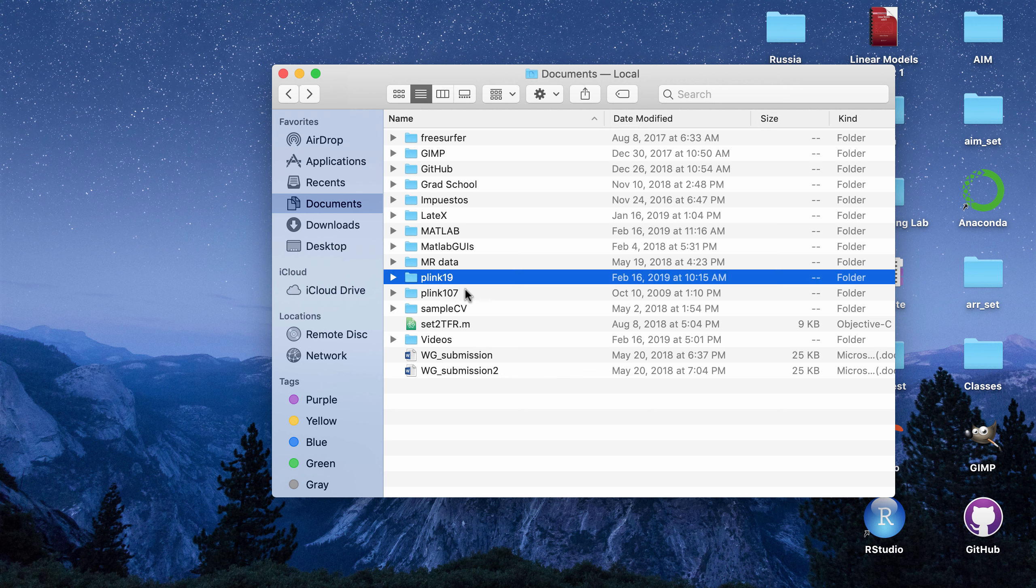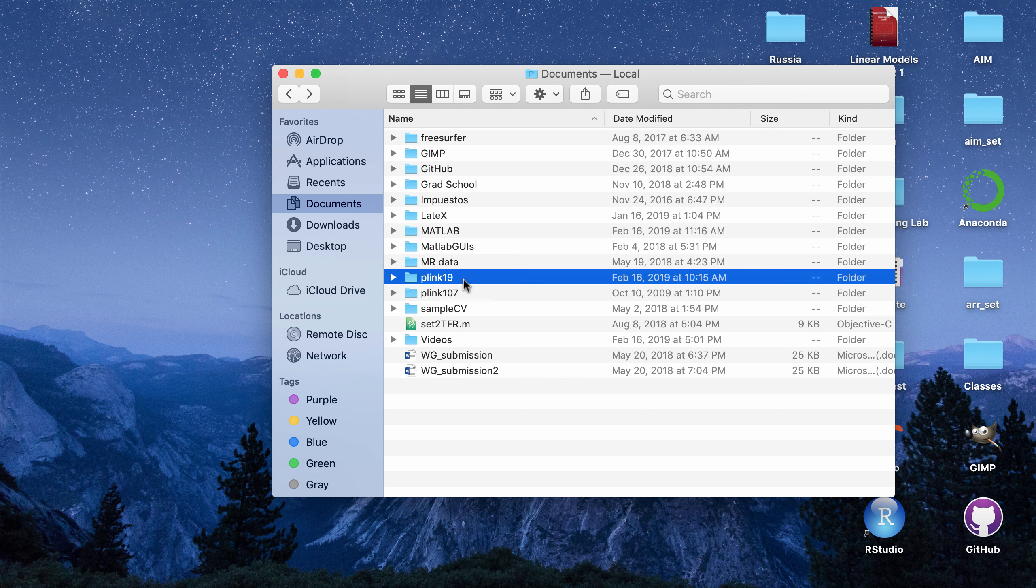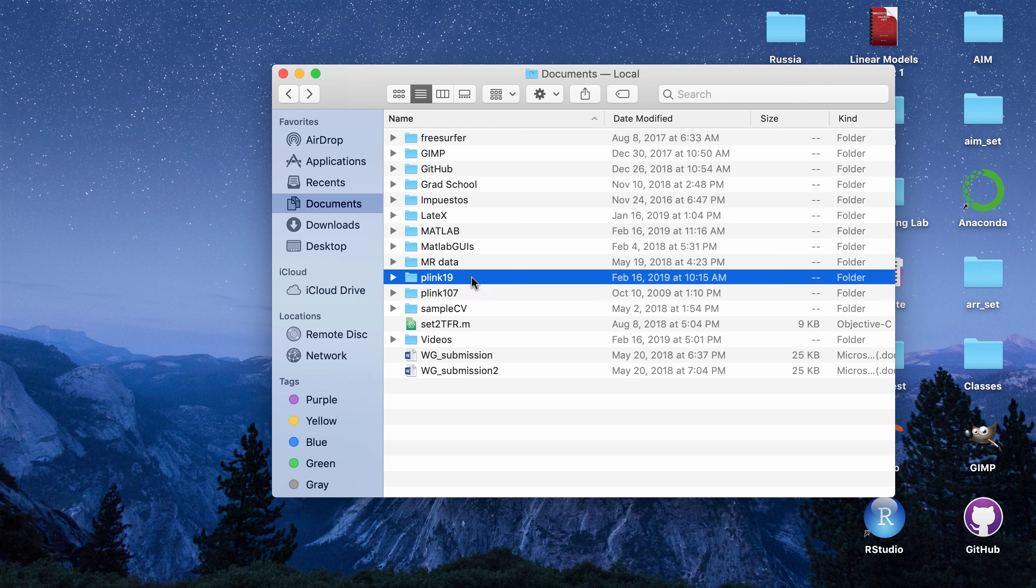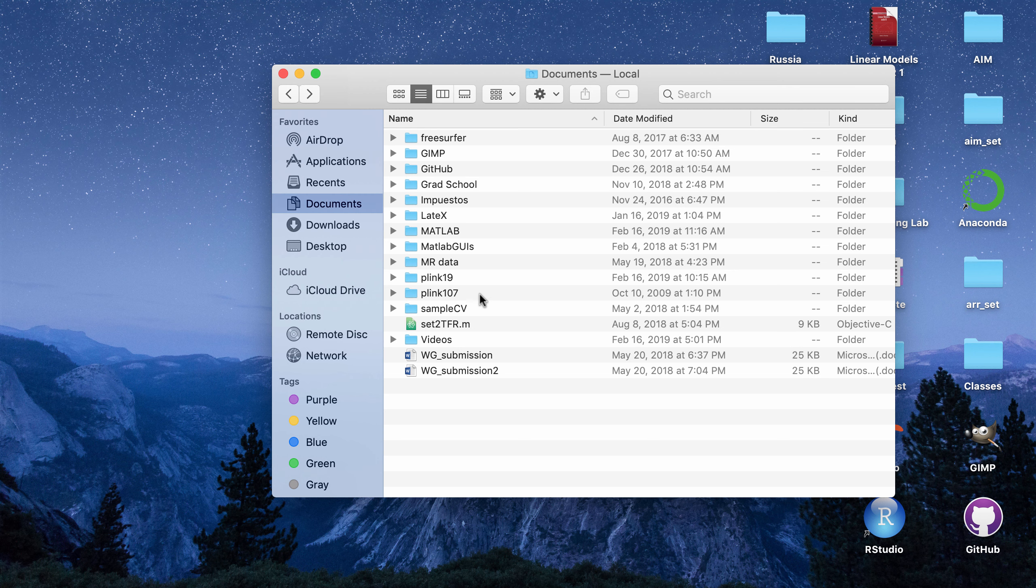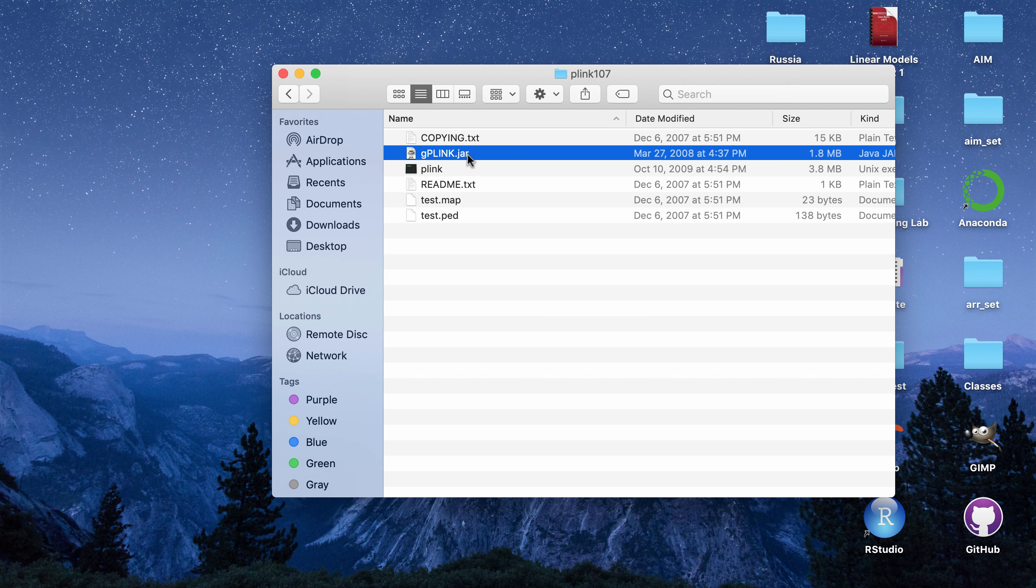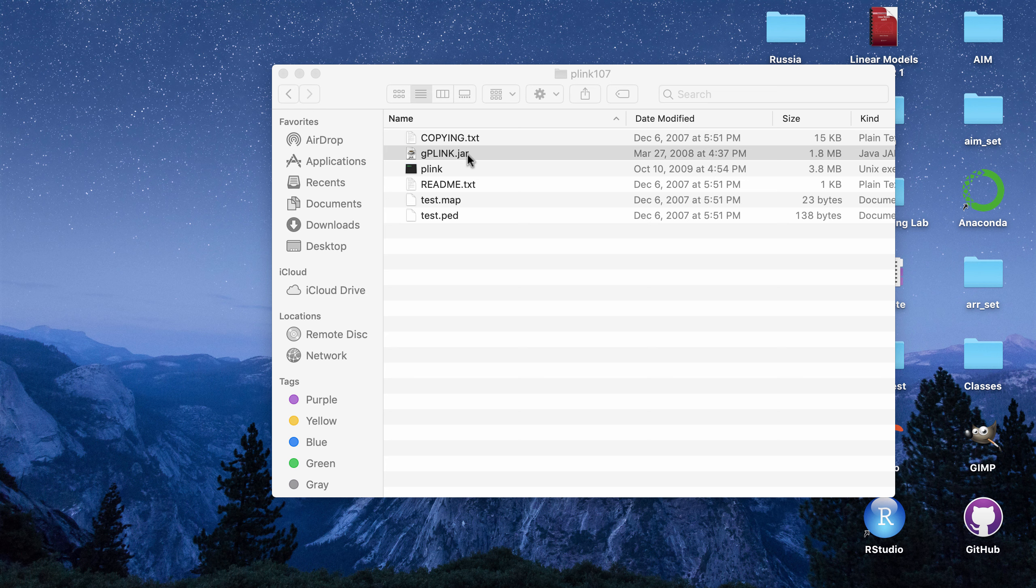So on my computer, I have Plink version 1.9 and 1.07, the original version, downloaded on my computer. I think I ended up not using any functions that are unique to 1.9, and I think that I could just use 1.07 for my analyses. And I liked that I downloaded 1.07 because it comes with a GUI that is not in the 1.9 download called G Plink. And I don't really use the GUI when I did the analysis that much, but I just think it's useful for looking at the results.